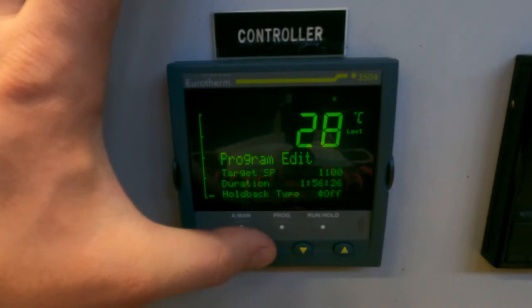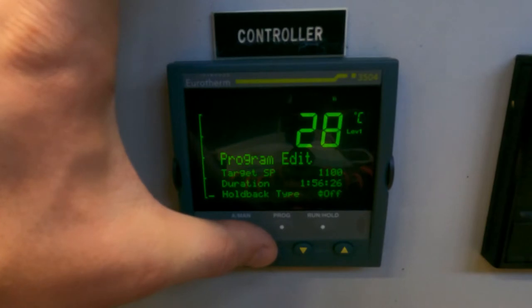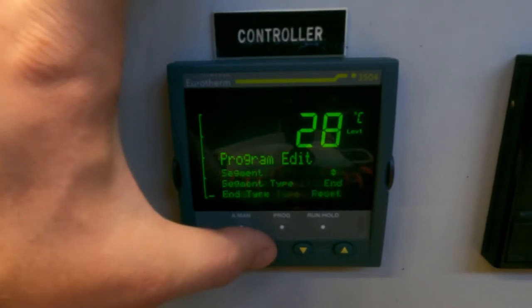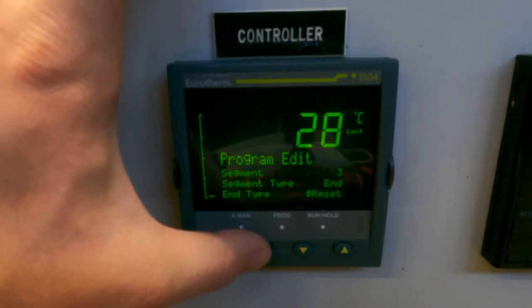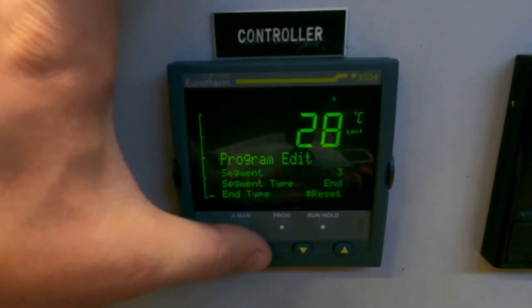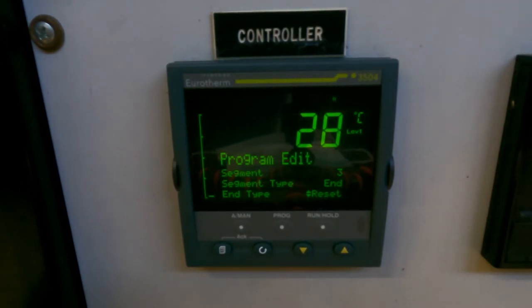So again, we have ramp rate, we have our hold. If I'm doing a 30-minute heat treatment I set it for two hours just so I have buffer time. When I do four-hour heat treatments, I'll set it for six hours so I have plenty of buffer time. Segment three is just an end-type segment and it resets. So what that means is that after whatever time you set the dwell to, it's just going to turn off. The program acts almost like a safety. With our box furnace controller in local mode for isothermal heat treatments, it doesn't automatically turn off after a certain time — so if you forget to turn it off, it will just continue to run indefinitely, which isn't great for power consumption and the longevity of the furnaces.